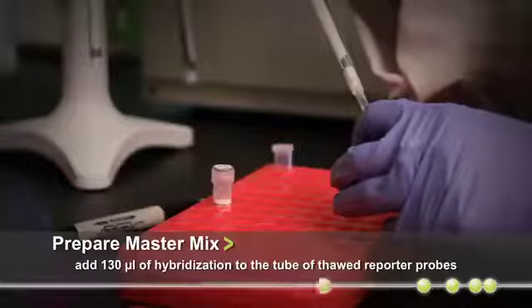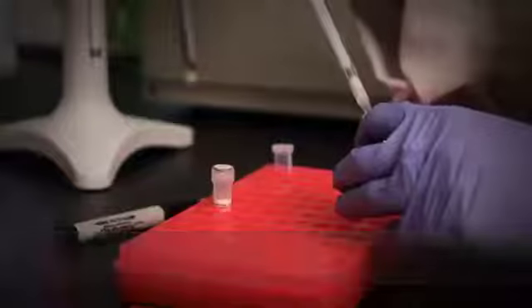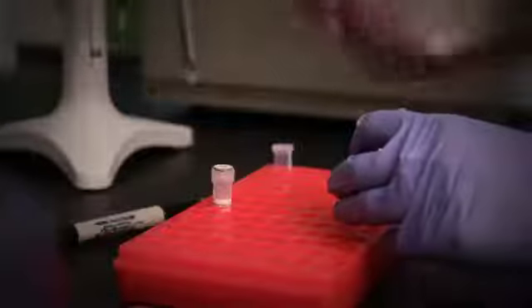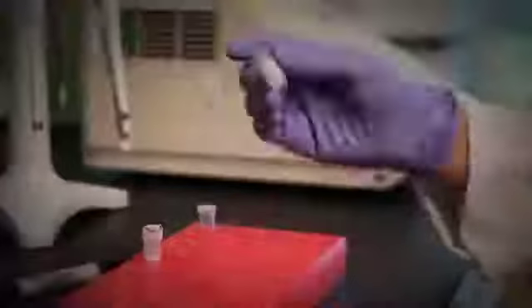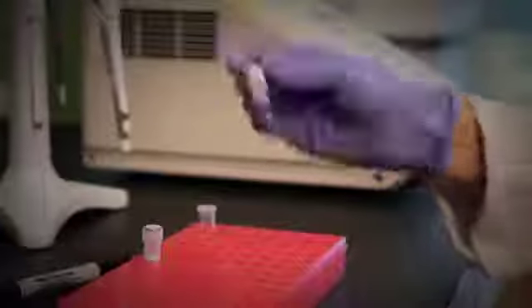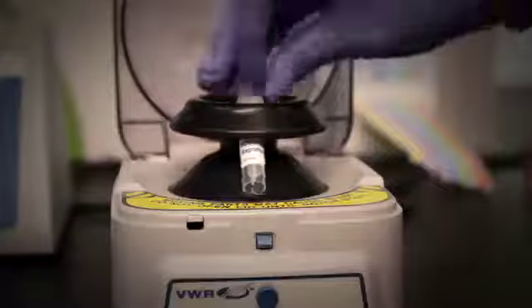We recommend adding the hybridization buffer directly to the tube of reporter probes to eliminate transfer losses of reporter probes into subsequent tubes. Mix gently by repeatedly inverting the tube and then spin it down in the picofuge to collect everything down to the bottom of the tube.